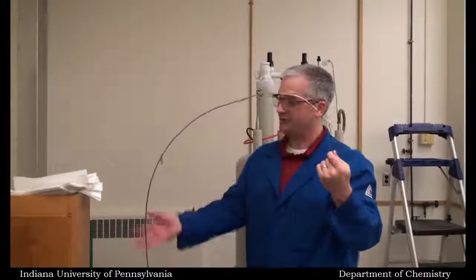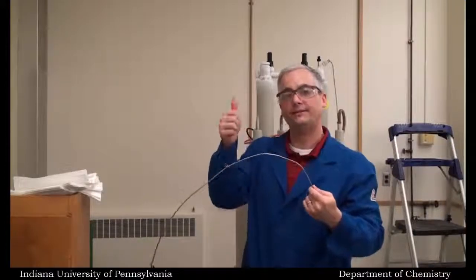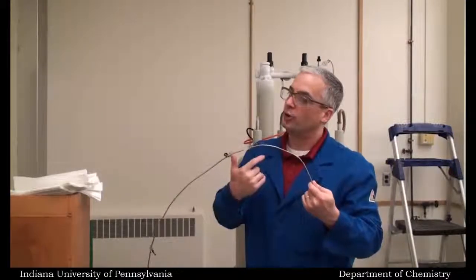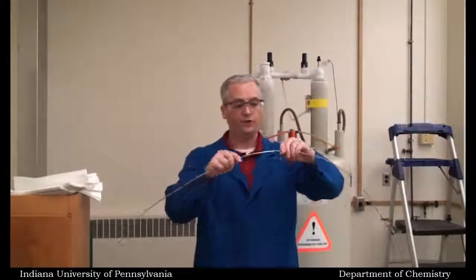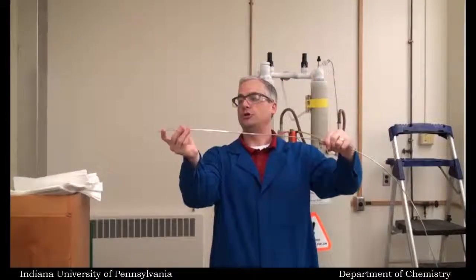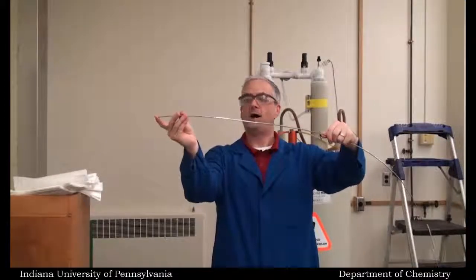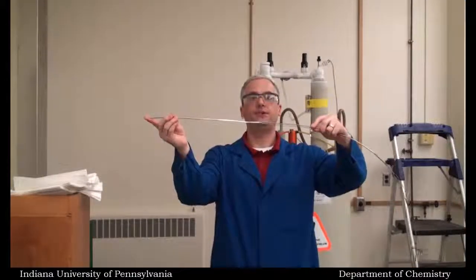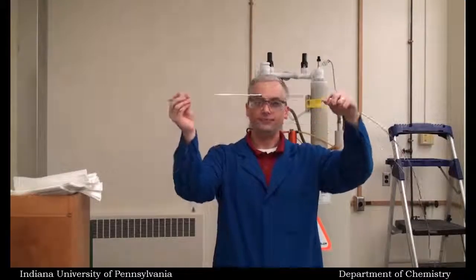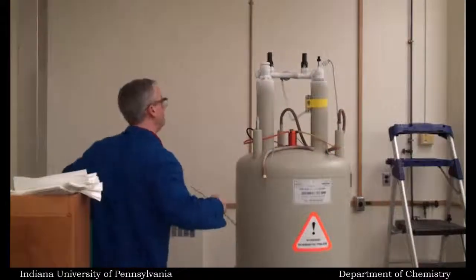You're going to hear a hiss, and the hiss is the gaseous nitrogen coming out. As soon as you hear a spit, as in somebody spitting in your ear, or you feel a cold bit of liquid on your ear, that's actually liquid nitrogen, and that's when you stop. If we stop it, and this is the top of the tube, and it goes up and stops the alligator clip here, we can measure the difference from the bottom here to the alligator clip, and that's going to be so many centimeters, and that's how we measure how much nitrogen's in the tube.